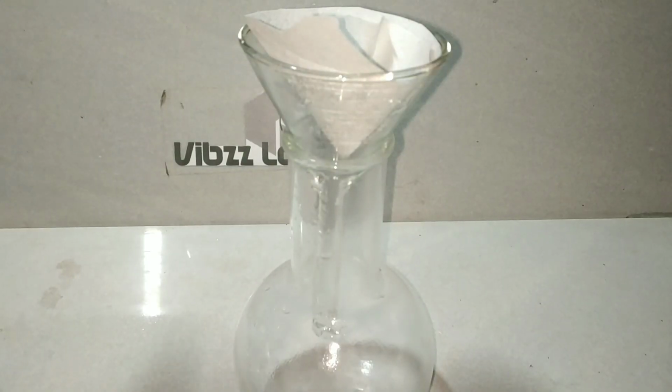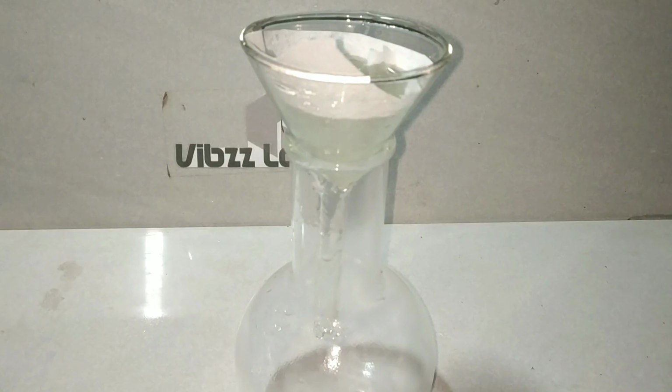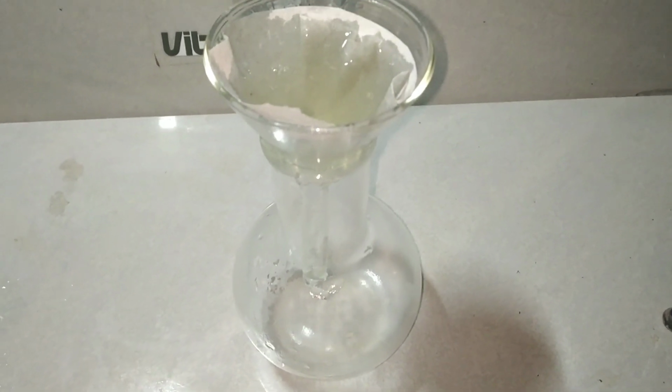Finally, we filter the solution to obtain the egg albumin as the filtrate. You can use a suction filtration, that is, vacuum filtration, if you have one, because the gravity filtration method is going to take forever because the particles are very fine and the filter paper will be clogged by the particles.